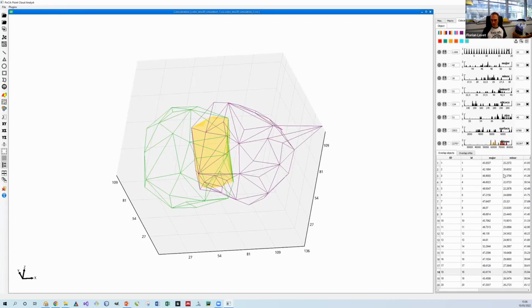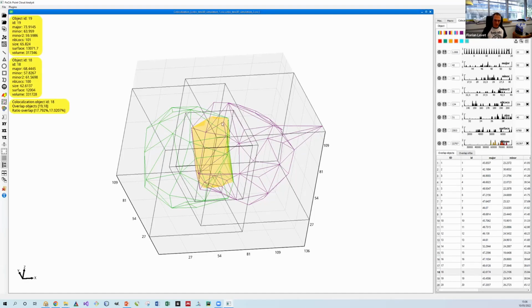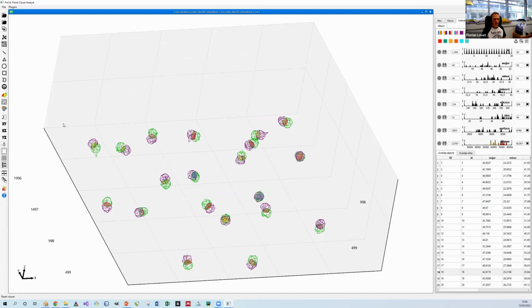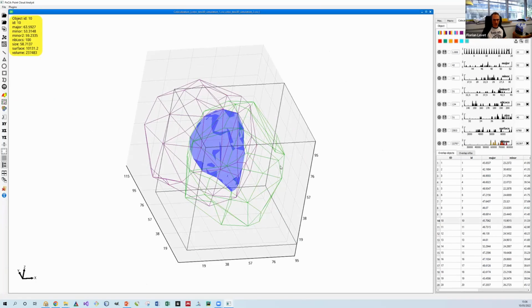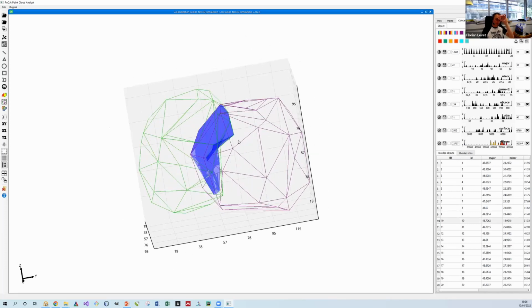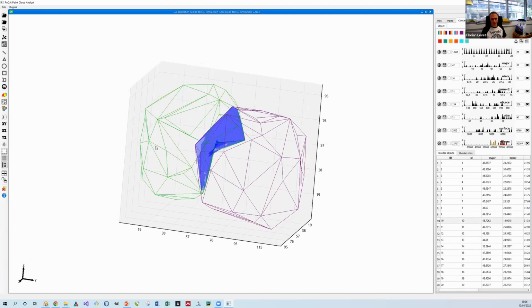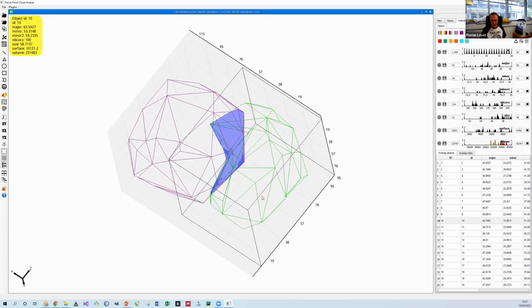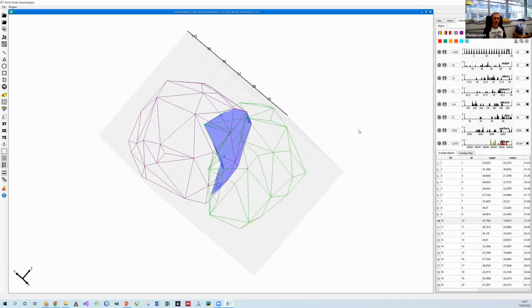And here I have all my colocalization objects. So I have 20 because I had 20 clusters in the two. And I have my whole distribution with the size and all this kind of stuff. You can very easily go to some object to see how it is colocalized. So it's still a little ongoing because I need to put it perfectly, but you can see that it's working already pretty well for object colocalization.